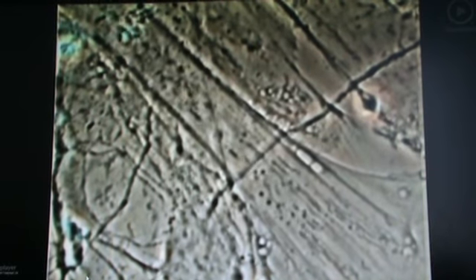Here you can see into the protoplasm of nerve cells with its different cell organelles. The moving, dark, small balls are small neurotransmitter-filled vesicles. The chemical transmitter substances carried in these vesicles are transported to the nerve contact points called synapses and are emptied there. The vesicles and synapses are jointly responsible for the transfer of nerve impulses.